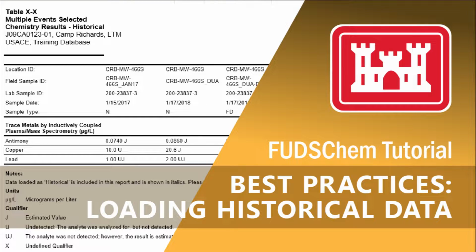This video will go over how to load historical laboratory data into FUDSChem. Historical data is typically entered outside of the traditional loading timeframe, often after the event is completed. This may be after data is finalized and validated. In some cases, entering the data into FUDSChem was not required at the time of data collection, but the USACE has since determined that the data should be included in the database.